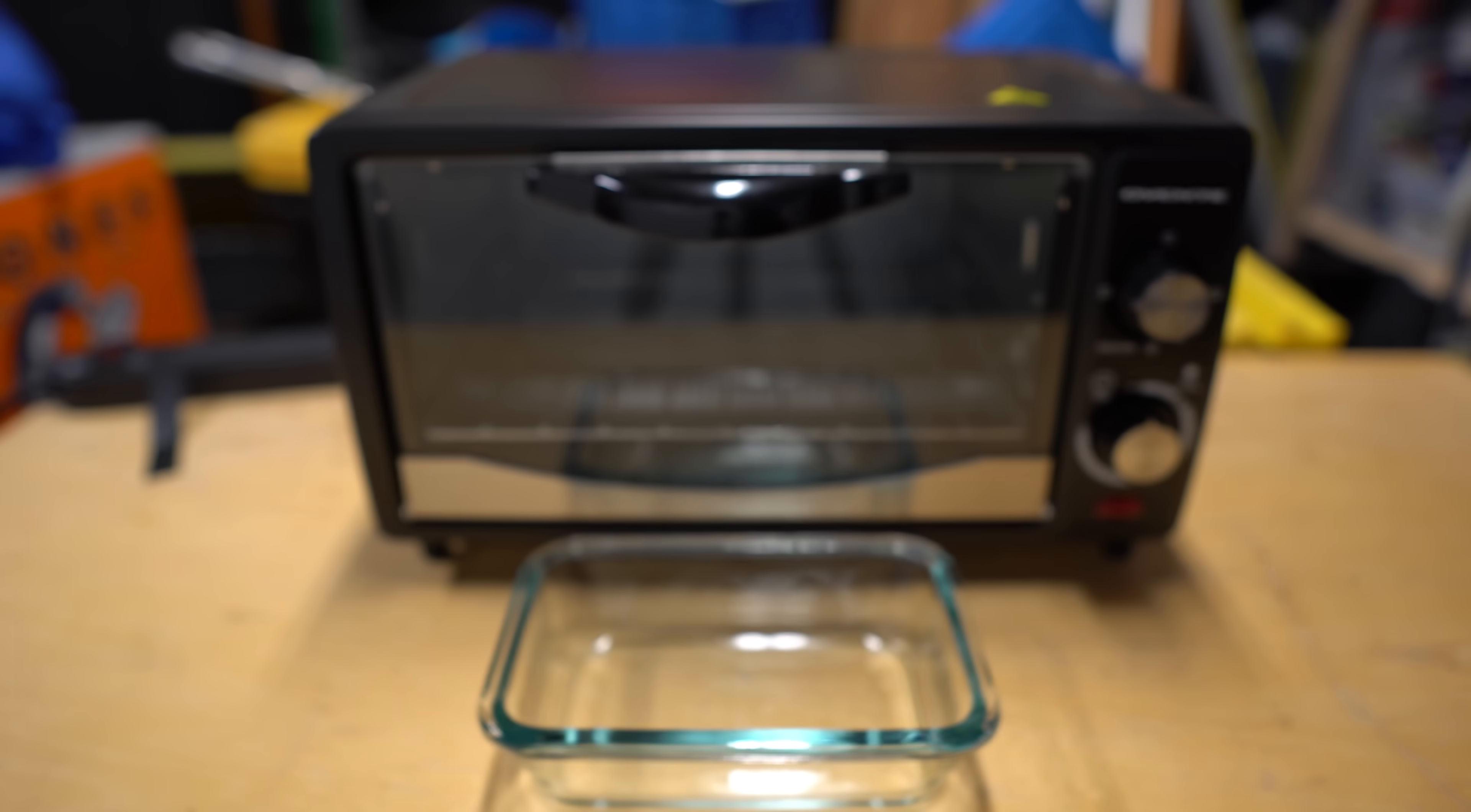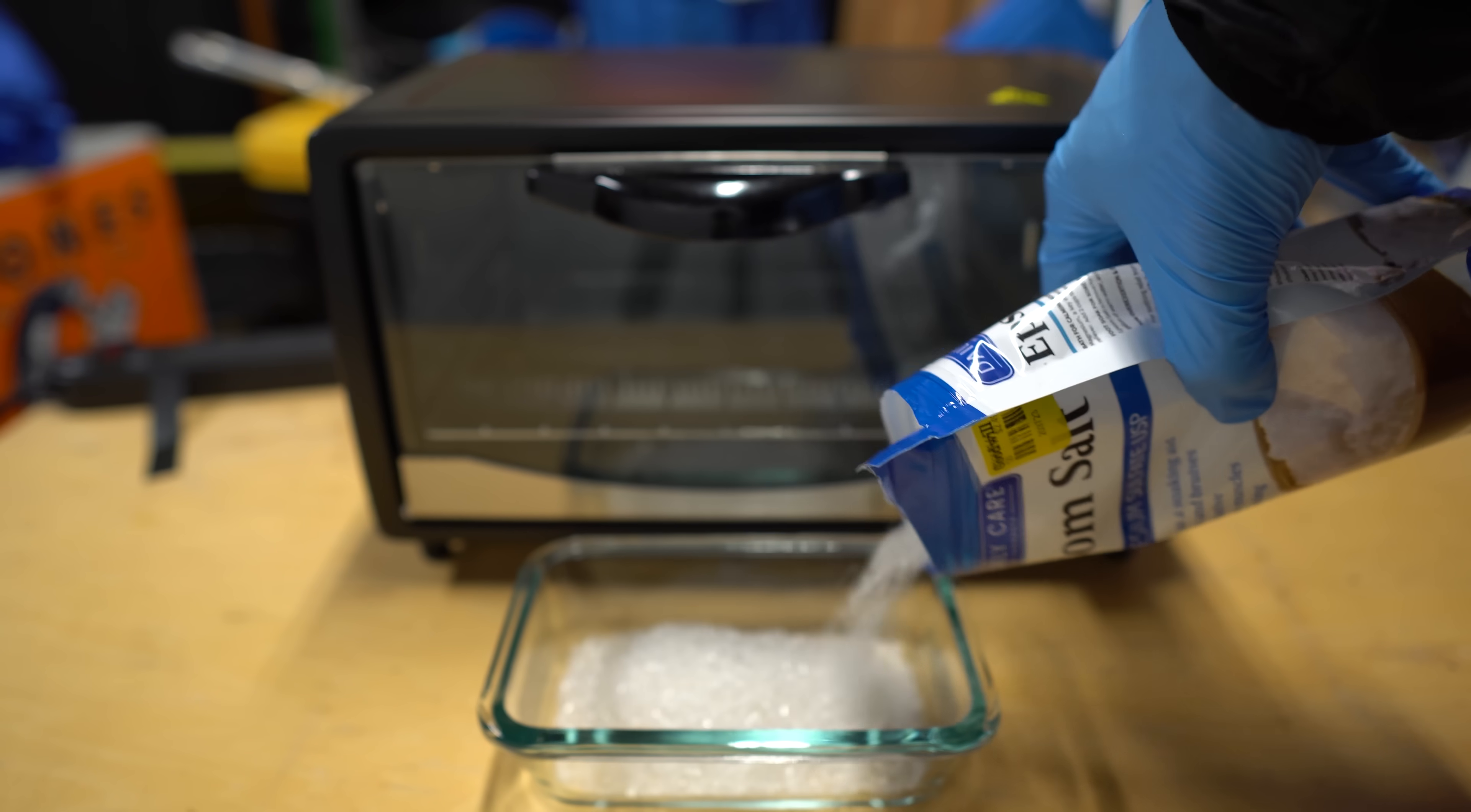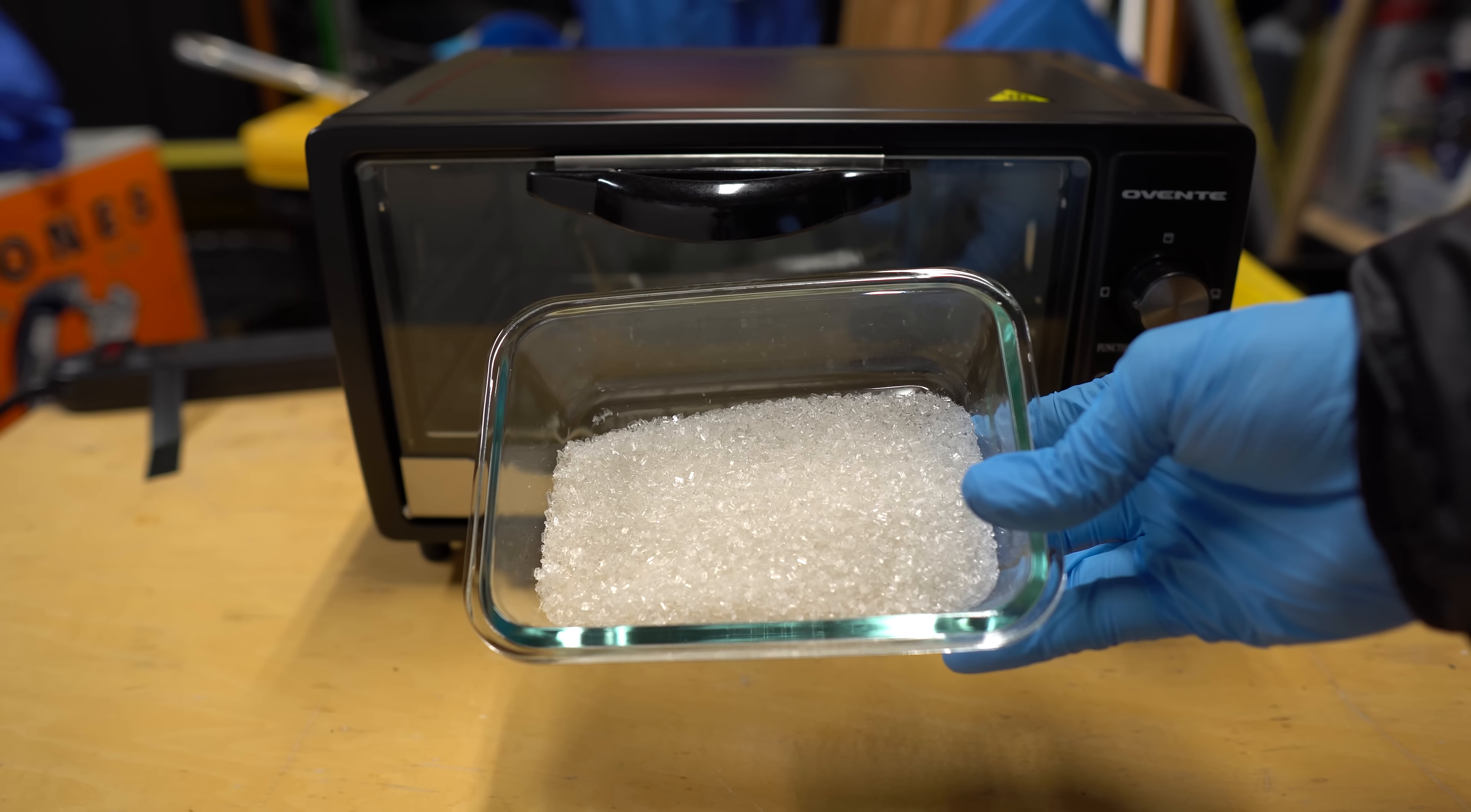First thing that we're going to do is actually make a drying agent. I'm using magnesium sulfate, which is just Epsom salt I got at my Goodwill, and I'm going to dry it in the oven so it can become anhydrous.